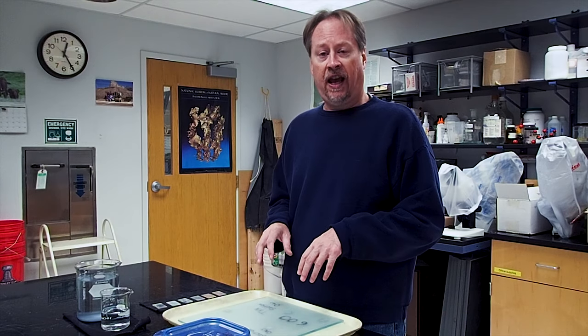Since our samples have been ground down with the geoform, we're going to bypass the coarser grit sizes and start with the 600 grit. However, if you pulled your sample a bit early as a precaution and it still has some visible thickness to it, you may want to go ahead and start with a 400 grit size.